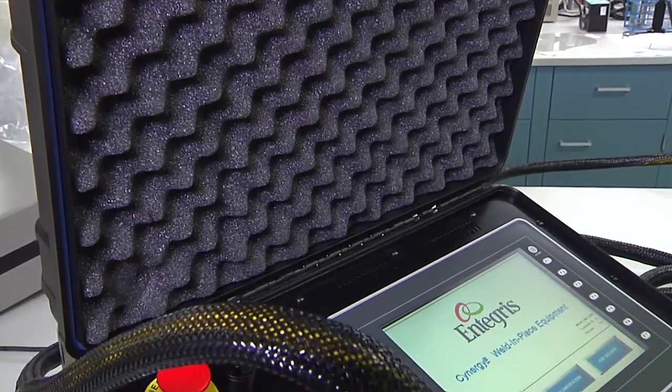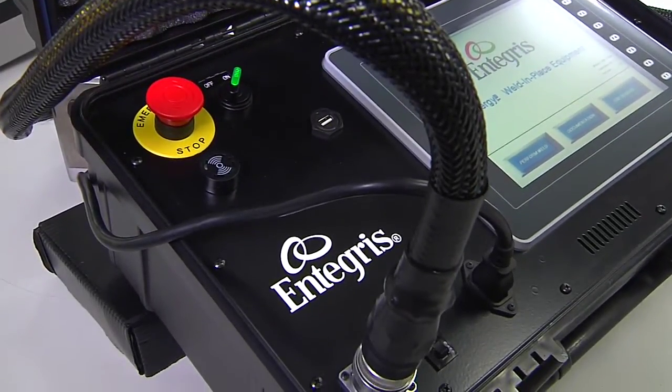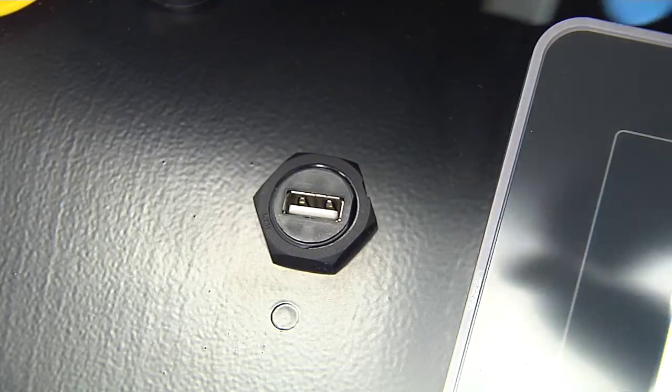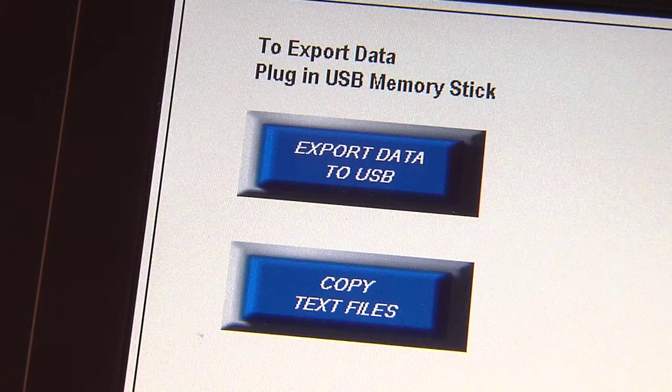The control module automatically determines process weld parameters. Its easy-to-use menu-driven touch screen, customized software, and accessible USB port ensure downloadable weld data for a complete weld history.